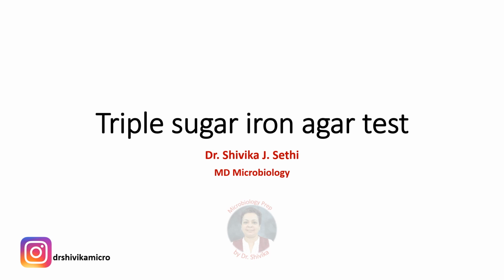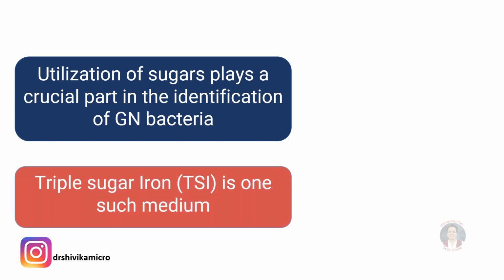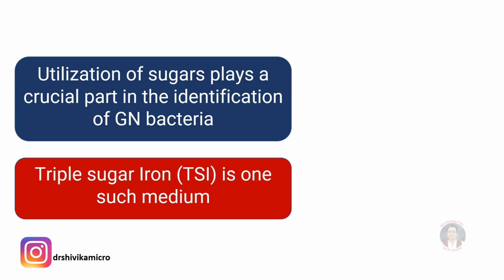Now, many biochemical tests like the catalase test, coagulase test, oxidase test are carried out for the identification of bacteria in the laboratory. Utilization of sugars plays a crucial part in the identification of gram-negative bacteria, especially the members of the family Enterobacteriaceae. TSI medium is one such medium.